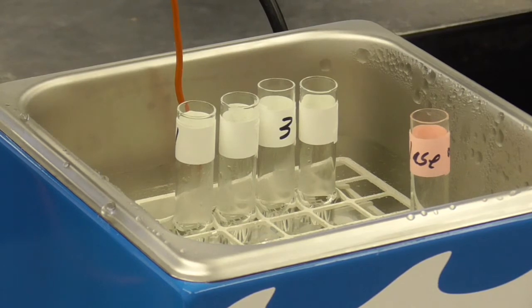And I think while we do that, let's go ahead and prepare the actual plate that we'll do the test in, which is step 3 in the protocol for part B. So you can bring the camera over here. Let's go ahead and do this next part.